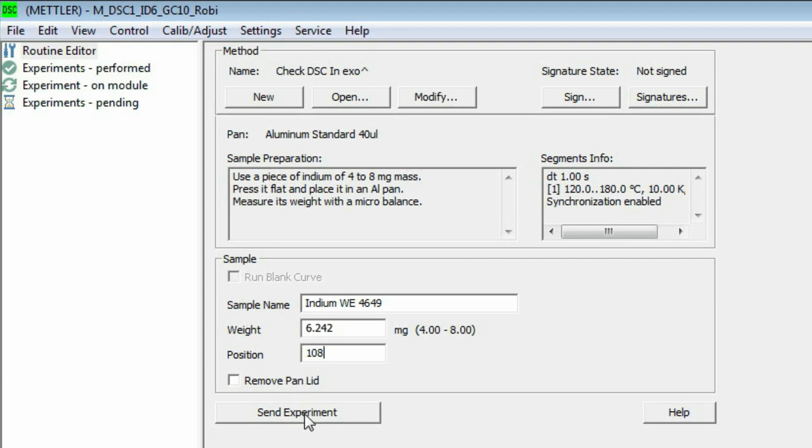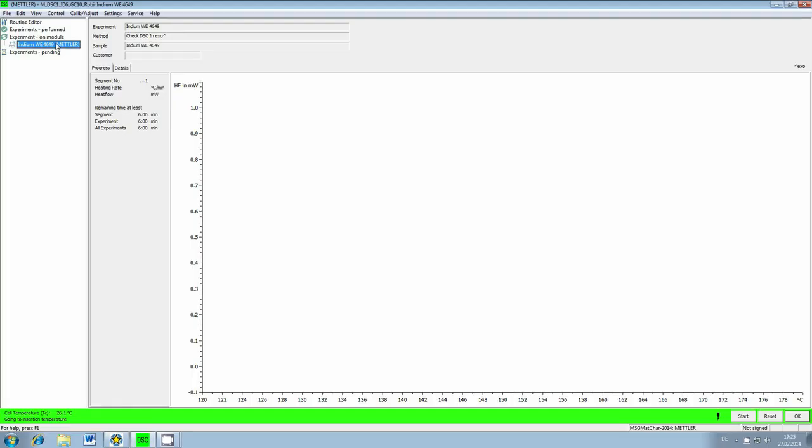By pressing send experiment, the data is sent to the instrument and database and the measurement begins.